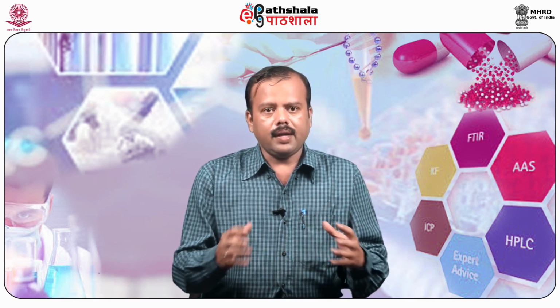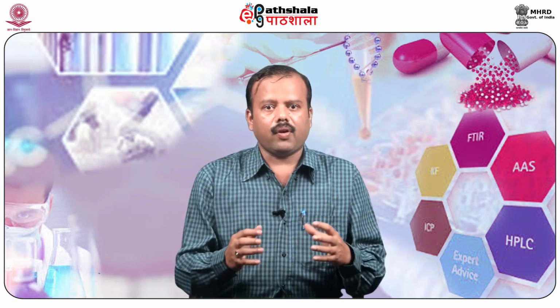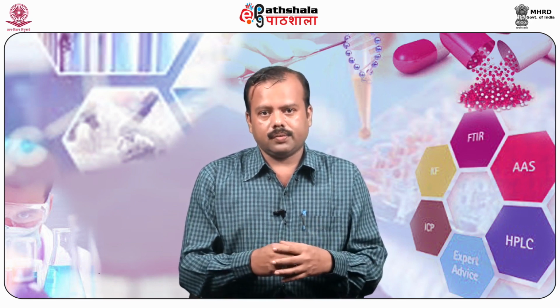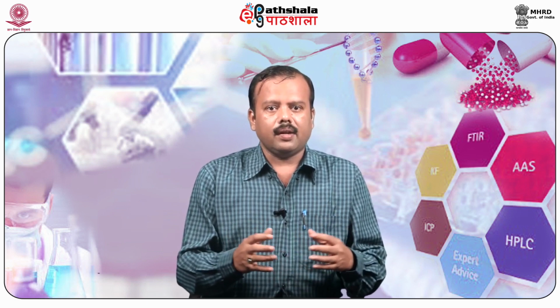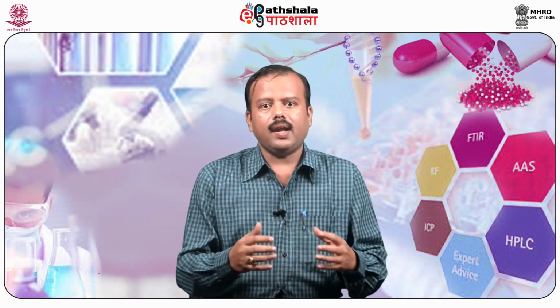After that, the carrier is dried and brought in contact with the disinfectant for a given exposure time and cultured in a nutrient broth. If there is no growth, that means the disinfectant passes, whereas growth indicates a failure.